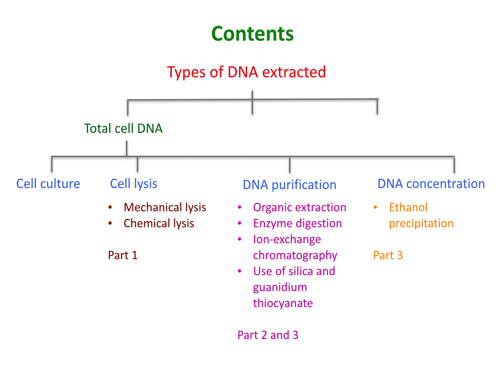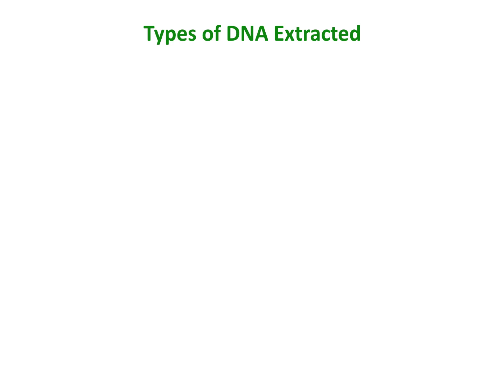In this video, that is the part 1 of this series, I will elucidate this process till the step of cell lysis. I will be discussing DNA purification and concentration in part 2 and part 3 of this series. Let's begin the topic by looking at the types of DNA that are commonly extracted by researchers.